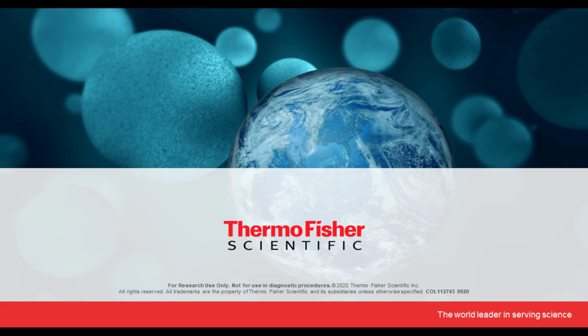So you would have to really test it out in your experimental system and see what kind of interference you're getting, and is that interference significant enough to block the signal to a level where your signal is really low, and then you can't use this reagent, right? So that is something that you would have to test out.